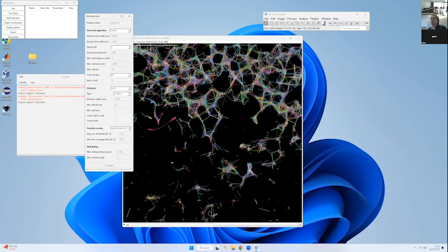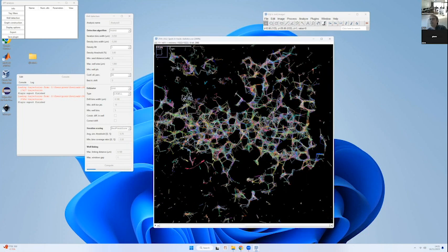So right now we are running the hybrid algorithm with the least square estimator for an elliptic boundary. And we are going to find the best ellipse based on the best parabolic score, which is derived from the least square error. So you remember I said there are different algorithms. You can choose the algorithm. You can specify some parameters, but here the parameters are the default. Okay, so do we need to change something here? No, you can just run it directly.